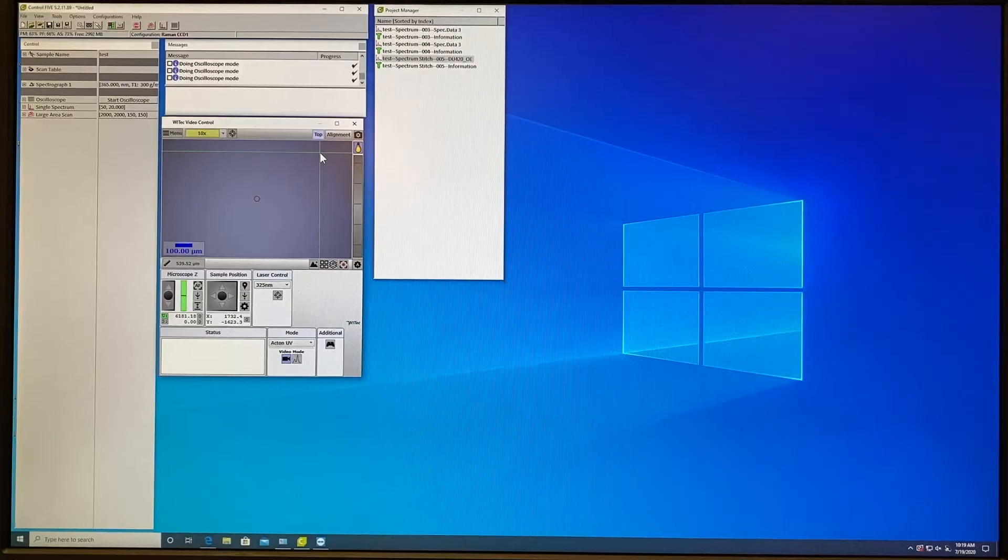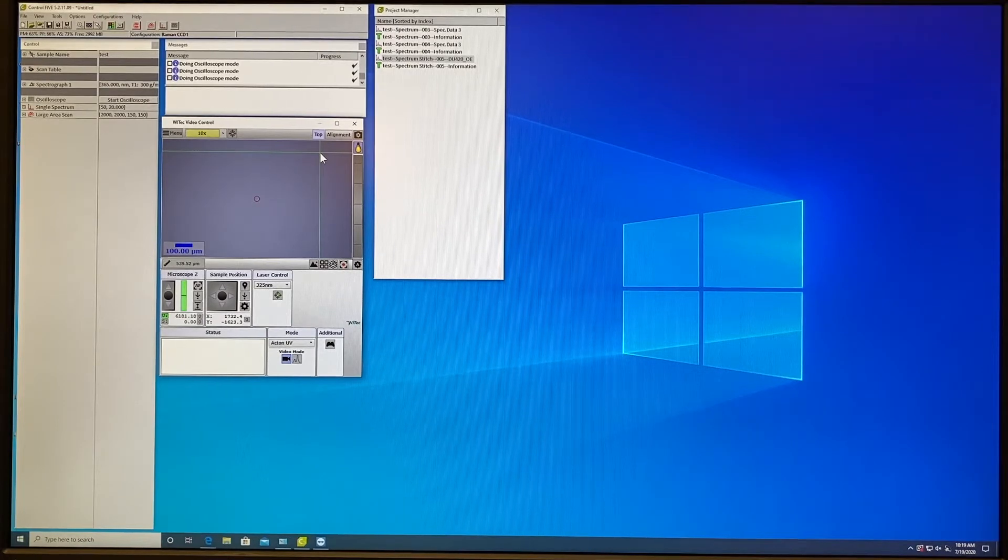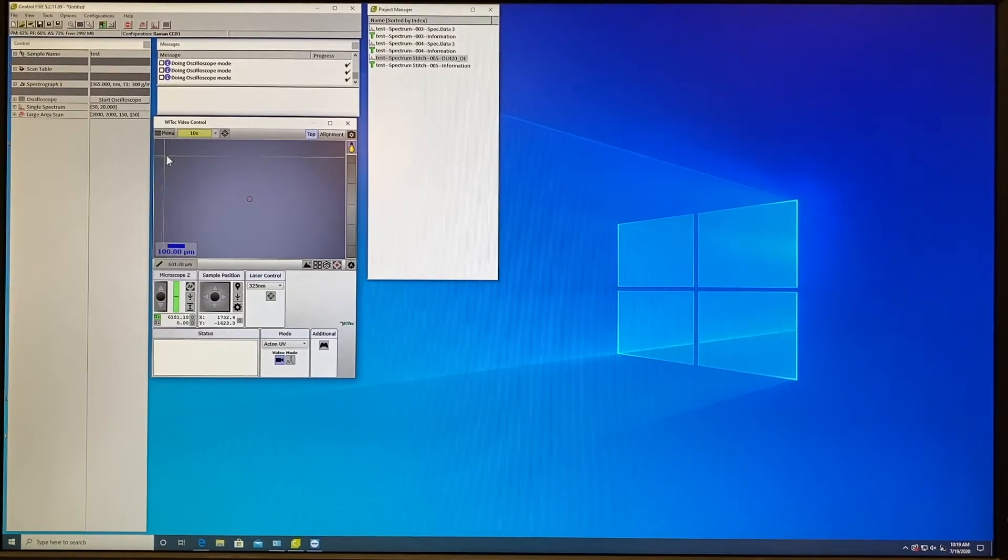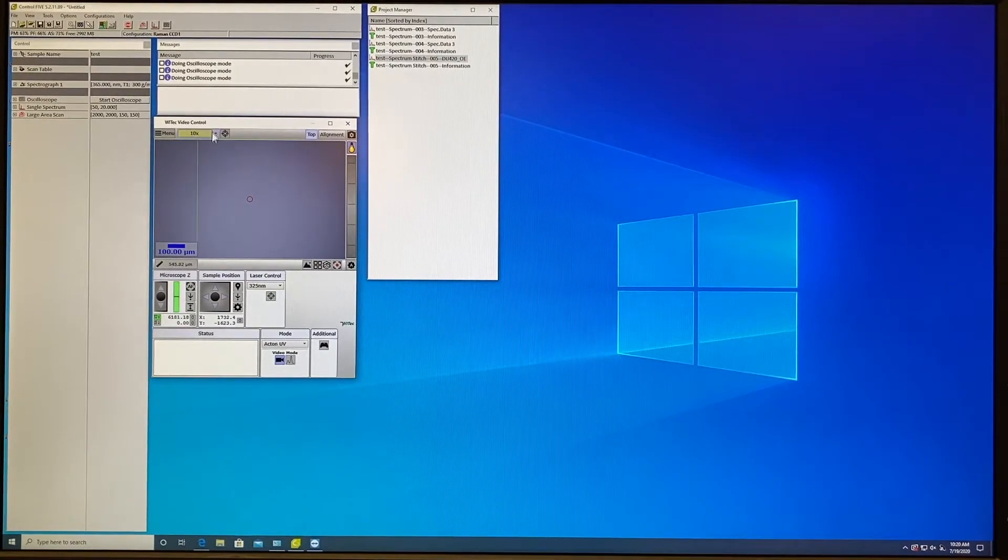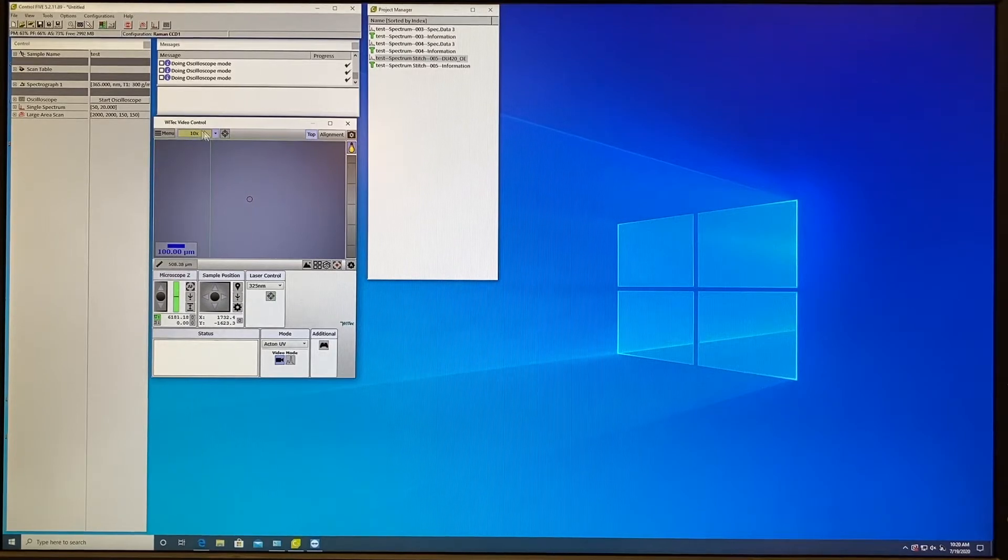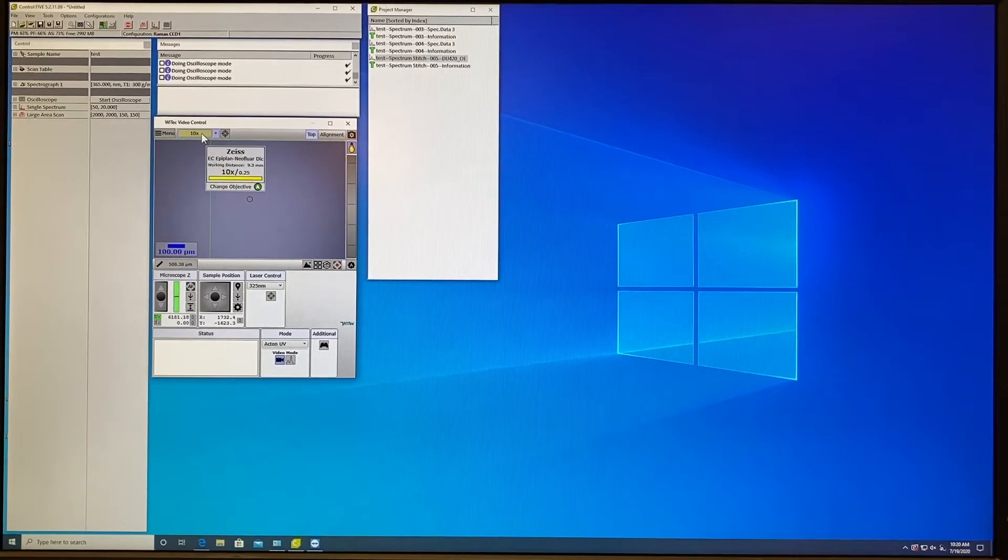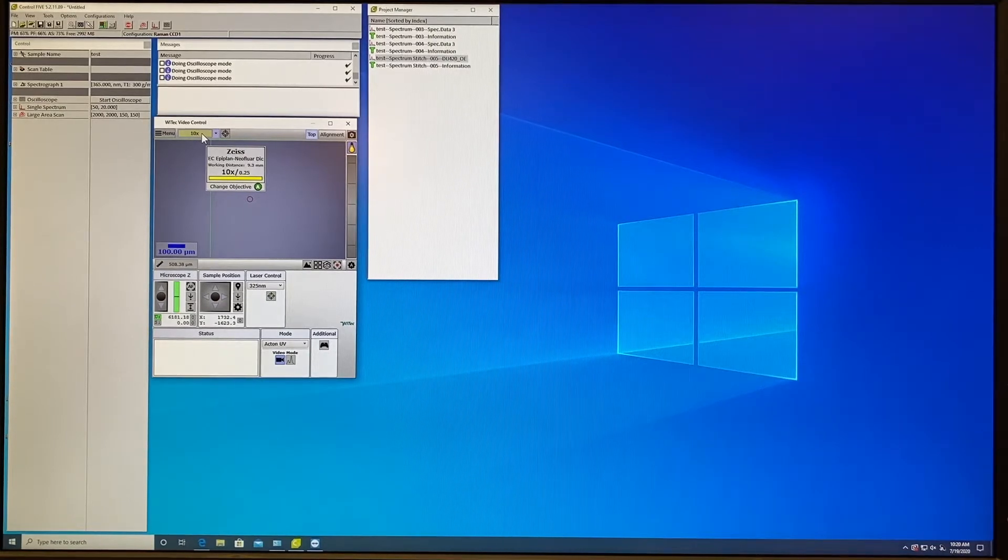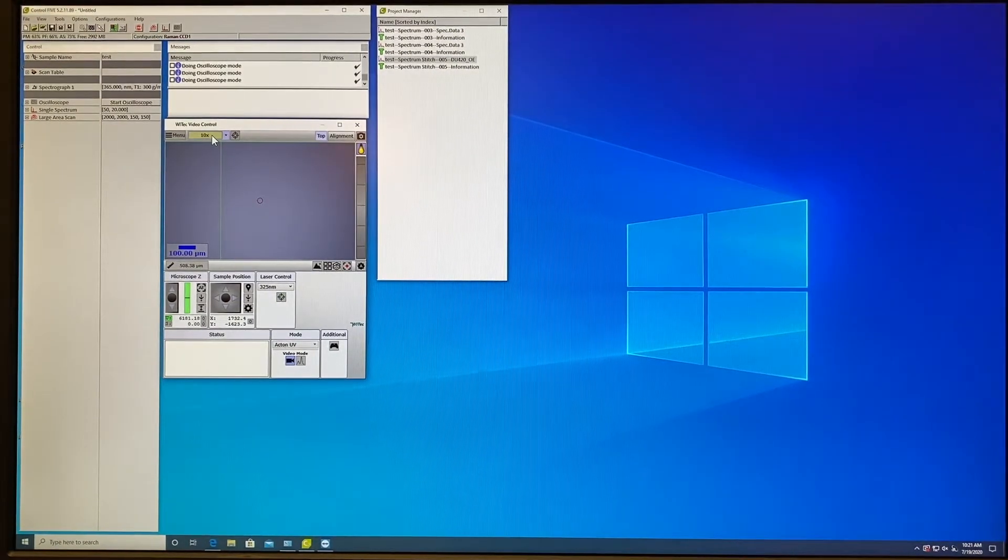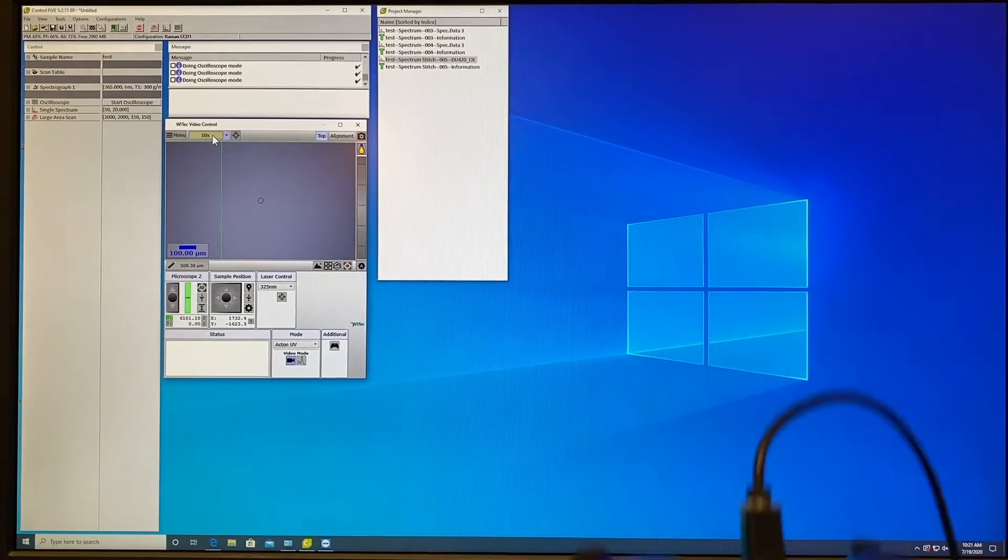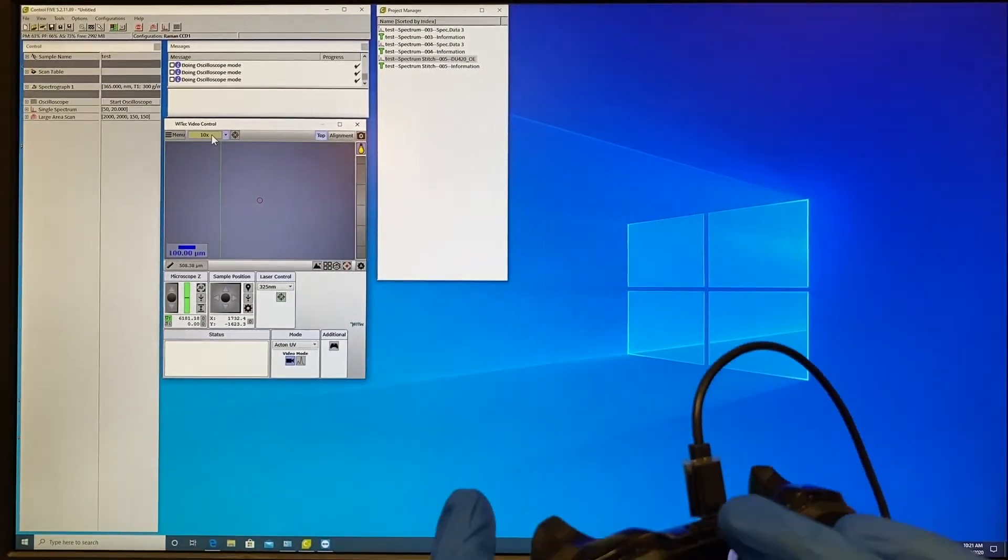While UV laser is under preparation please start focusing on your sample using 10x objective. Here you can see the indication which objective is in current use. Check if this 10x objective is selected on the stage as well. The procedure is similar as for Raman collection. First you need to use the joystick to focus on your surface.